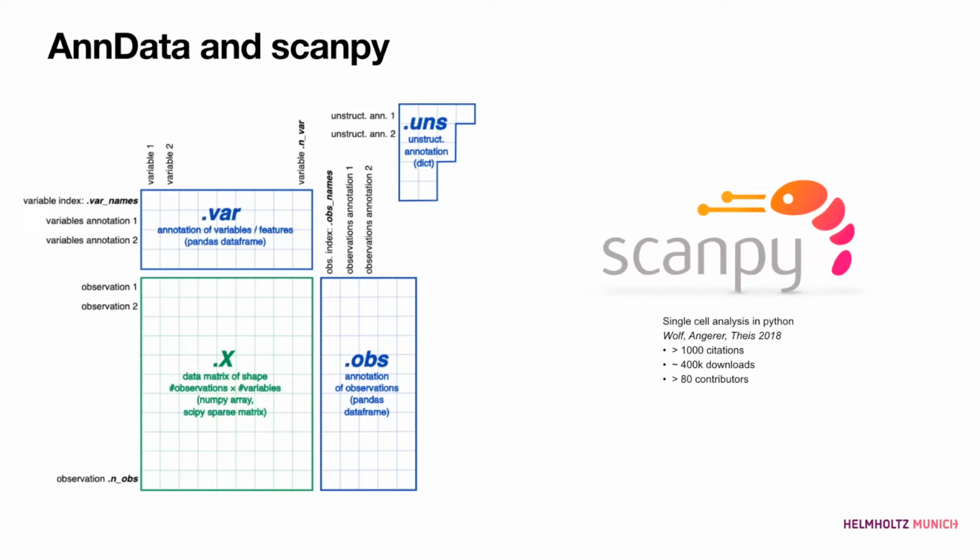So these are either 1D or 2D data information. So in addition to obs, which is just a pandas data frame, there could also be obsm, which is then a matrix that also has the cells as a common axis. But for example, if we're talking about spatial data, it could actually contain the X and Y coordinates of where your cells are coming from in the particular tissue. So this could be stored in obsm here.